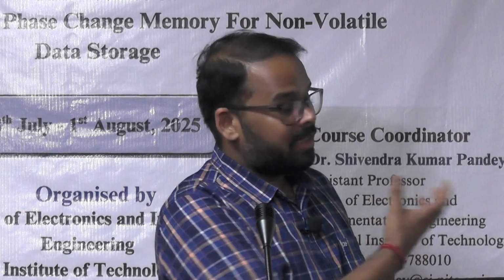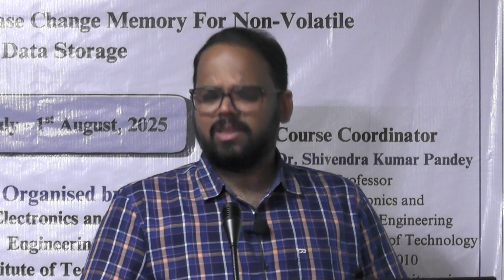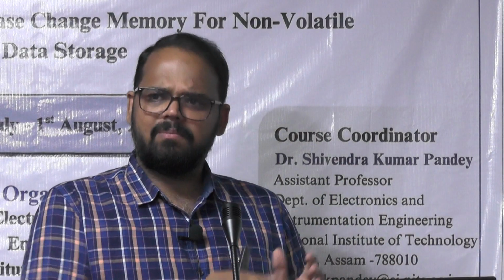If you do your own research on targets, you can do that. It depends on the size: in this sputtering we have a 2-inch cathode, somebody else may have 3-inch, so you prepare accordingly. If you need precise control on stoichiometry, there are vendors who can provide the appropriate composition, and then you can do research on that.